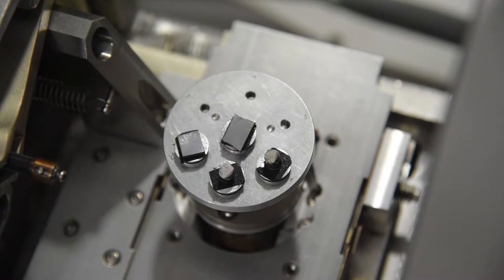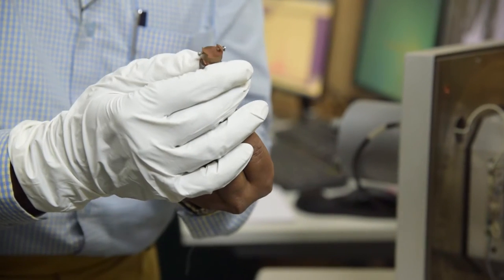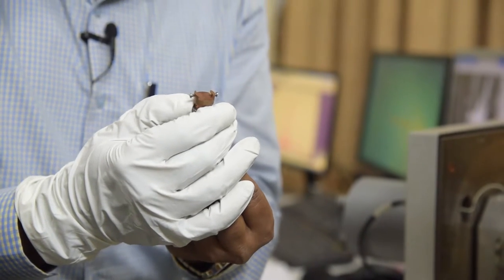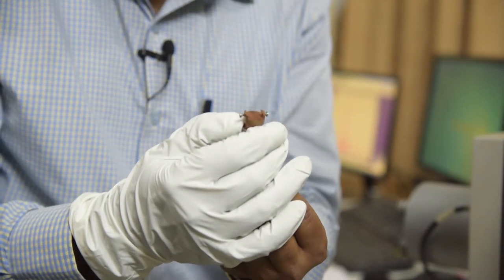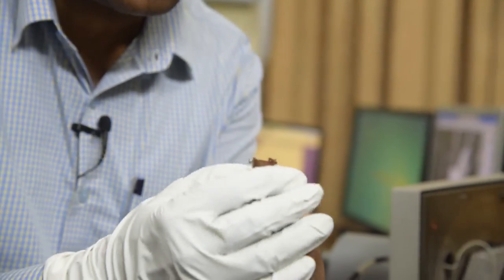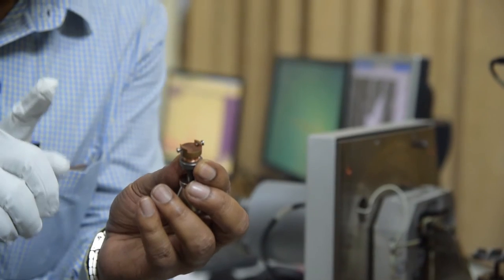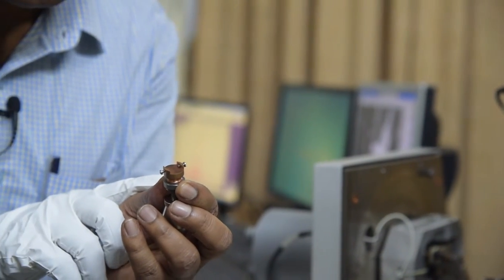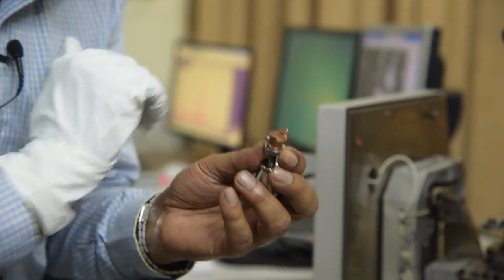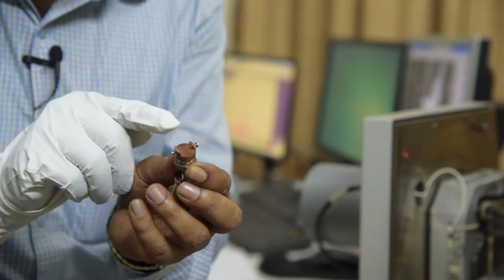Over this, a polished specimen is placed and you are able to see it. This is the specimen stage for placing a sample for EBSD. That means in case you want to understand the microtexture, you are supposed to fix your well polished sample in between this. Remember that the polishing of this sample for EBSD detector studies is very, very crucial, and we cannot afford to compromise. Otherwise, your whole effort of using such a wonderful equipment will go in vain. So we need to be careful. So the slot, you are able to see it?